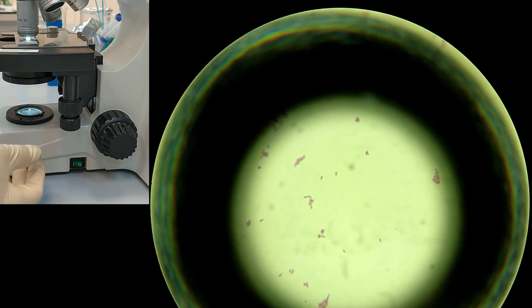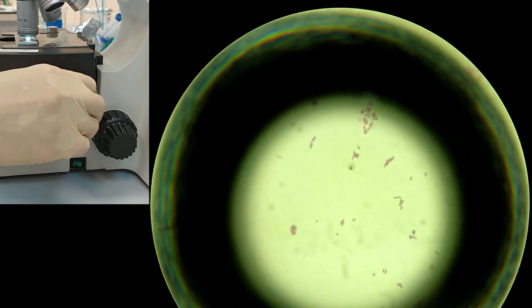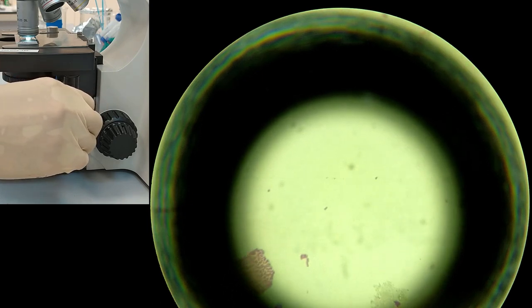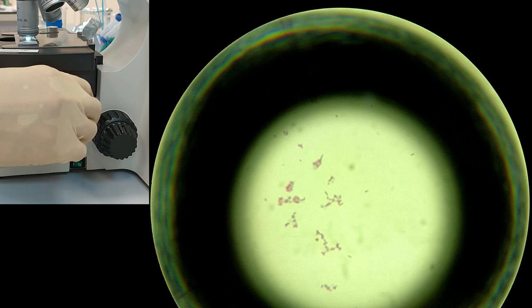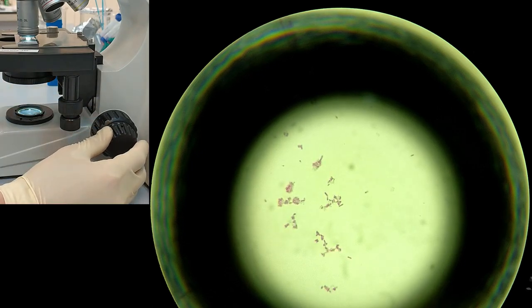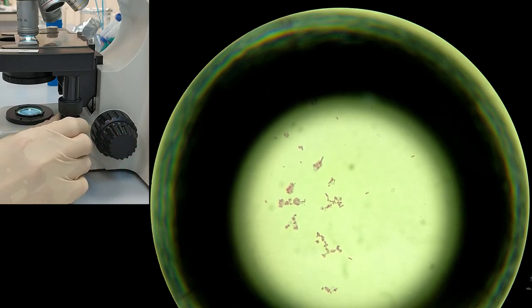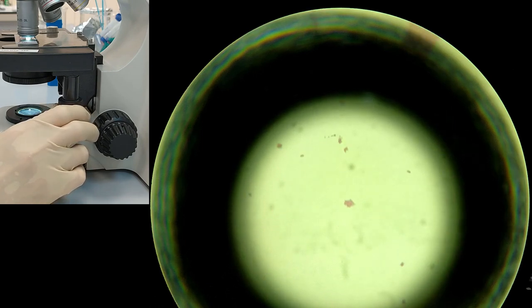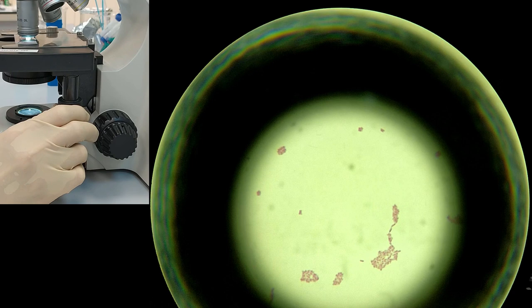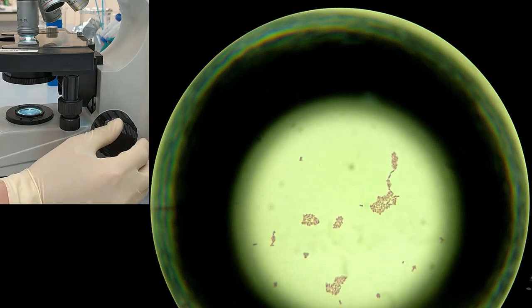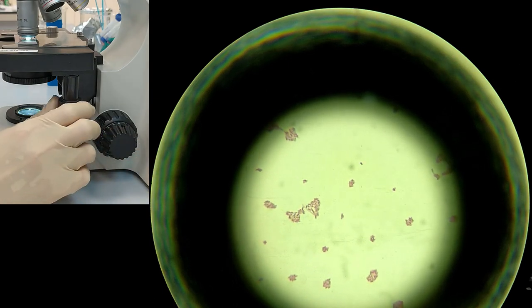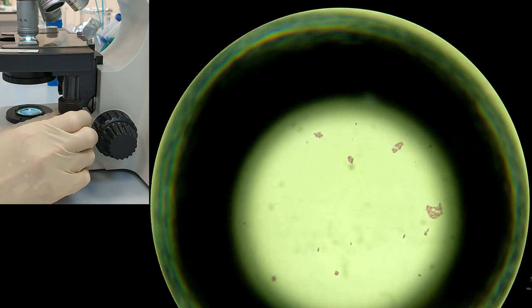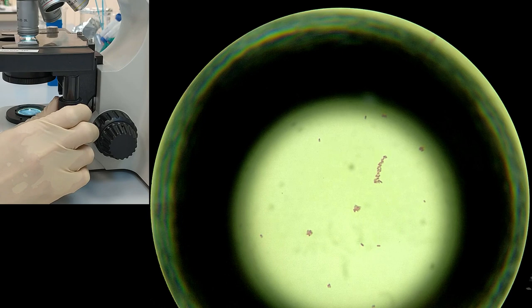Now you can see the cells. They look like small rods and they are very small. As you can see here, they are really in the shape of rods. You can find bigger colonies and single ones, like here. Just find the best view for yourself and draw them in your notebook.